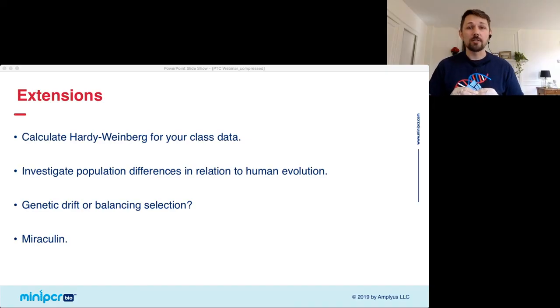That is just also a thing to note. If you teach with populations that have a lot of students who are of African descent, those rarer alleles that I talked about are a little more common. Again, the test still works, so you can still do this test, but it may be something that you want to bring up and talk about.